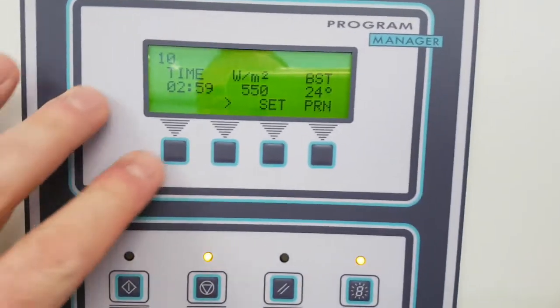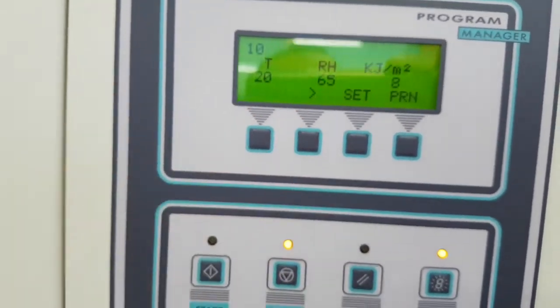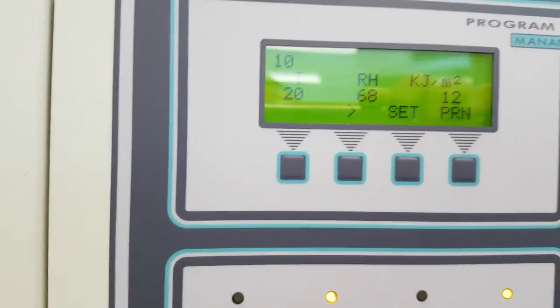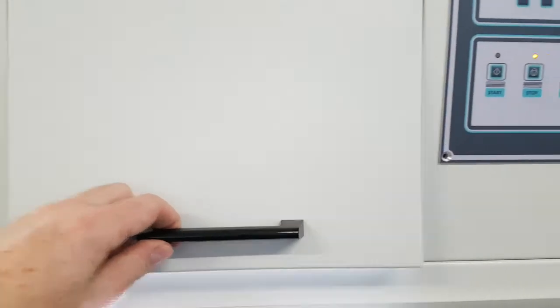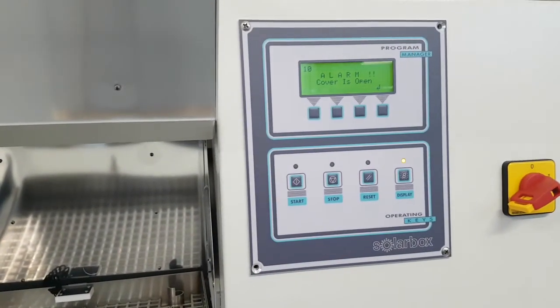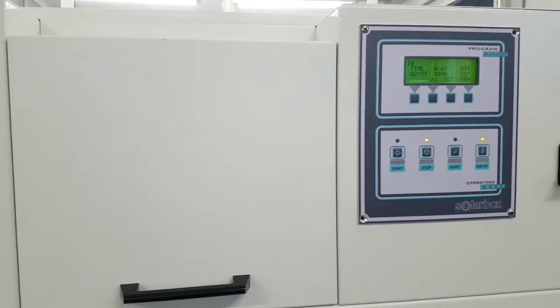You can see here on the display the RH is now at 66 — it's going up until 70%. There is an automatic stop when you open the device; an alarm shows 'cover is open.' When you close it, it restarts automatically.